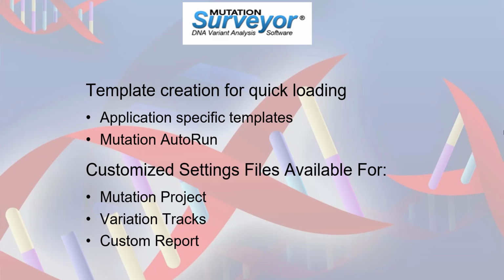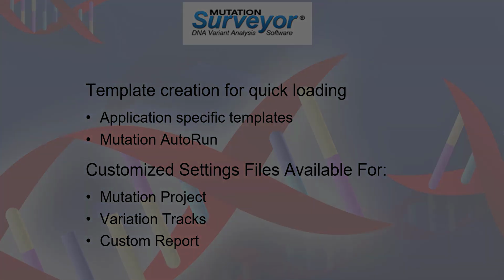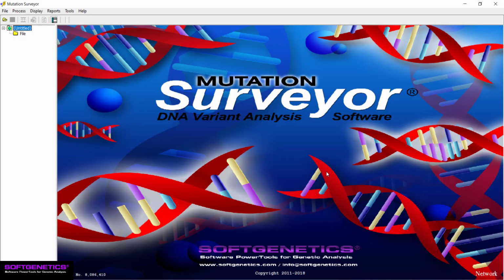Configuration files can be created for three different features of the software: the Mutation Project Settings for setting your project parameters, the Variation Tracks for annotation display and mutation call filter settings, and the Custom Report for quickly generating customized output. Let's take a look together at how to create and load each type of configuration file.